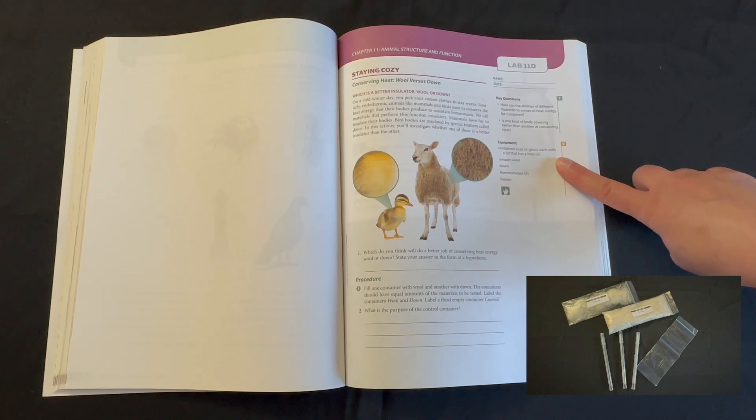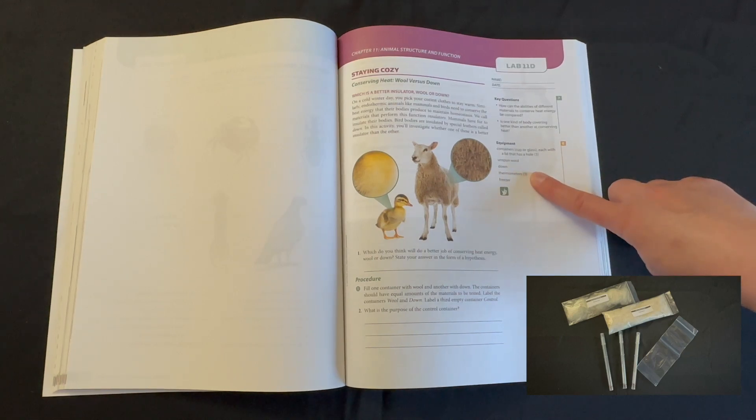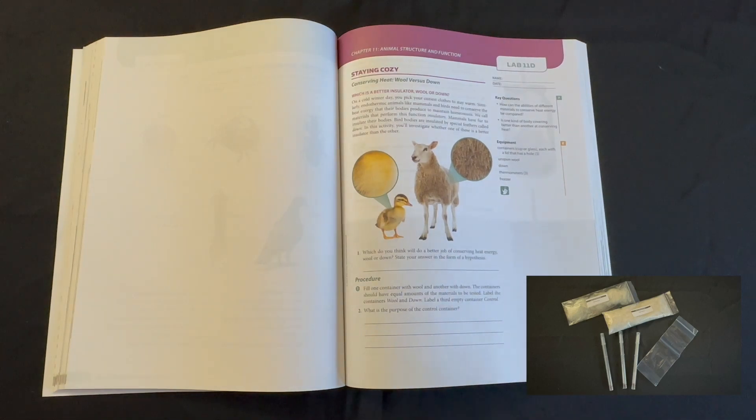We also have the equipment we will need: containers each with a lid that has a hole, unspun wool, down, three thermometers, and a freezer. Your student's procedure is also listed. Keep in mind, you will want to look at your student's addendum in their science lab kit to see if there are any slight changes to this lab.